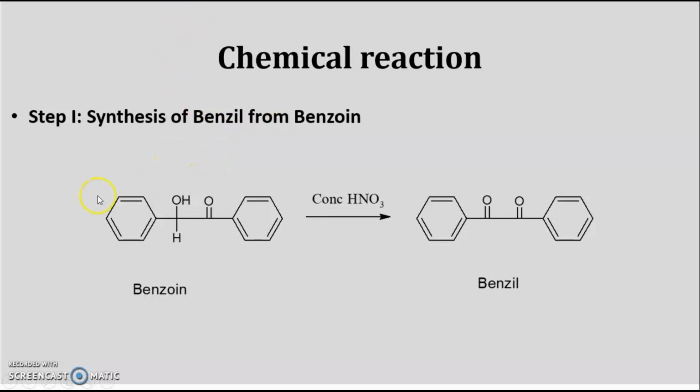phenytoin. So this is the chemical reaction which involves an oxidation reaction, where concentrated HNO3 is used as an oxidizing agent which converts benzoin into benzil.